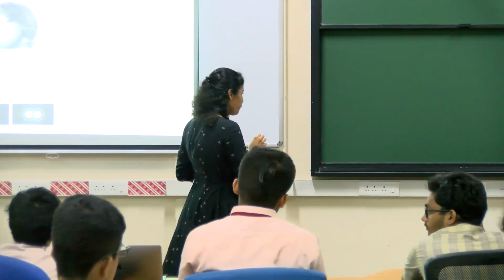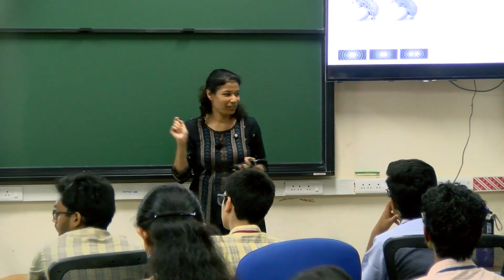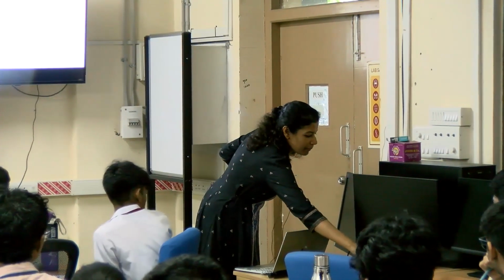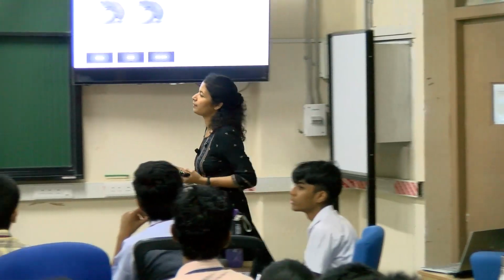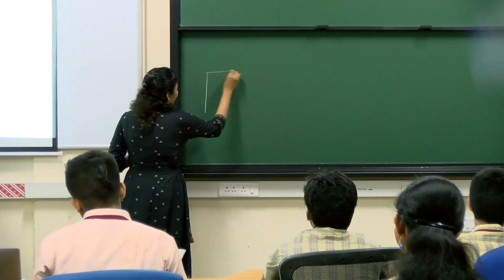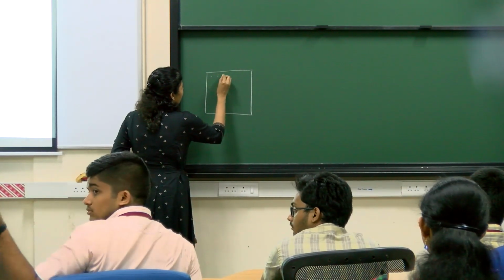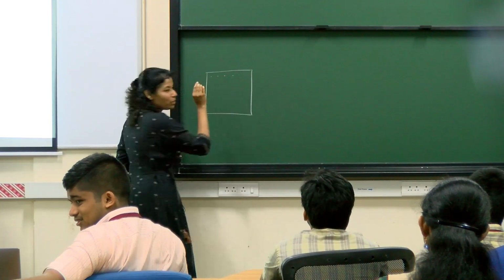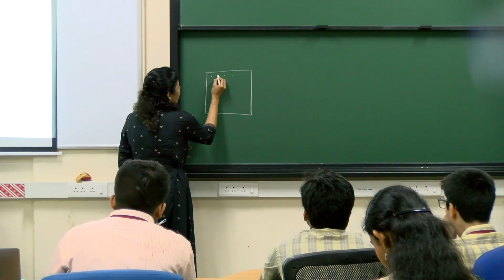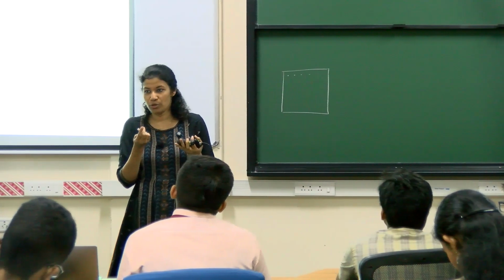So if you have an image, right? This is made up of many small dots which make up the image. So each of these dots, how well you can separate out, that defines the resolution of your image.